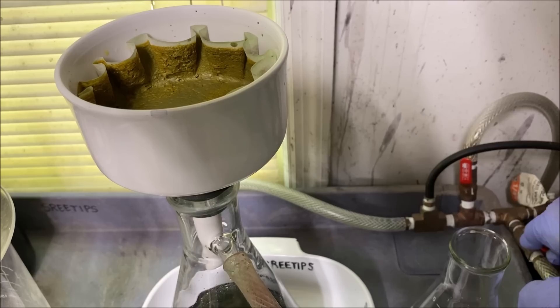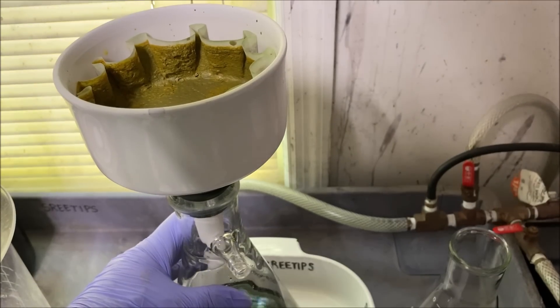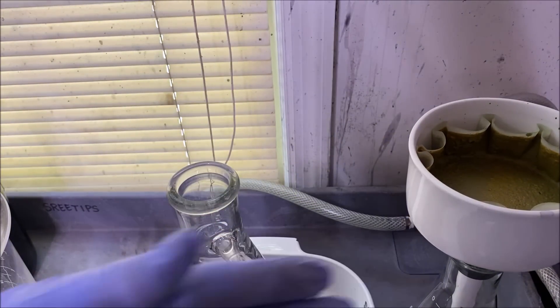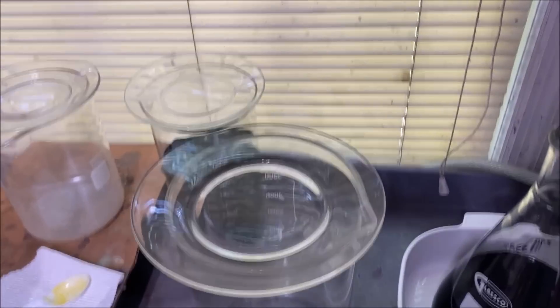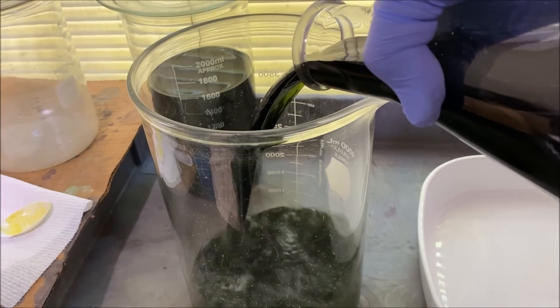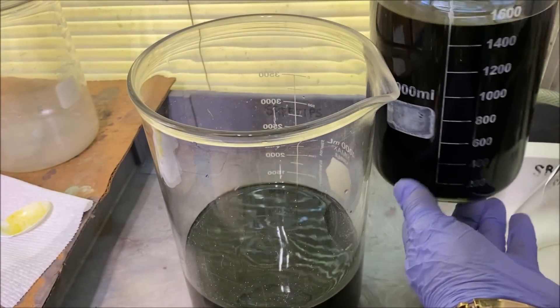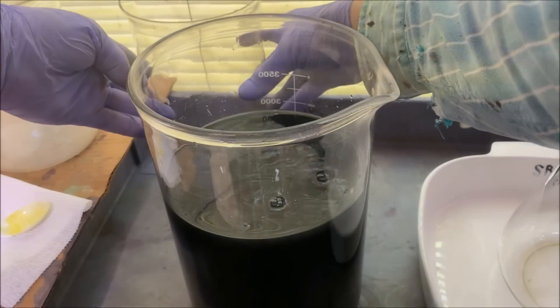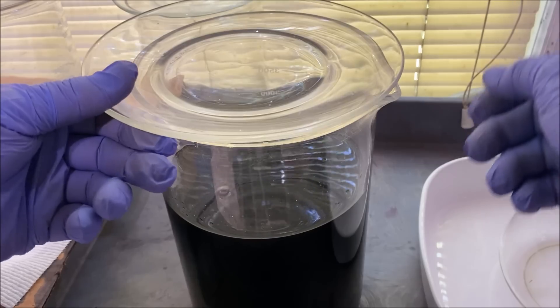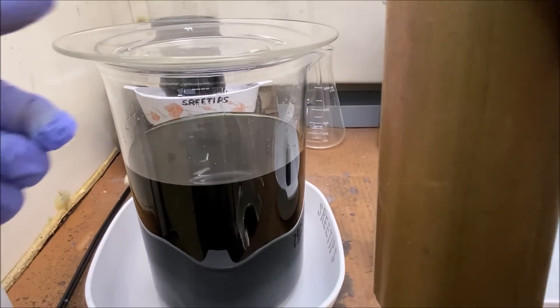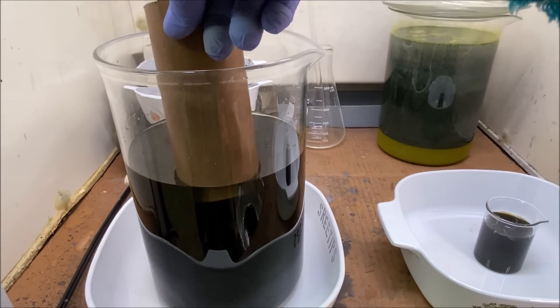Turn the vacuum off and pull our funnel. There's our filter. Now what we'll do is I'm going to add the solution to this large beaker. I've got a piece of copper here. I'm just going to go ahead and cement the silver out of this solution carefully.